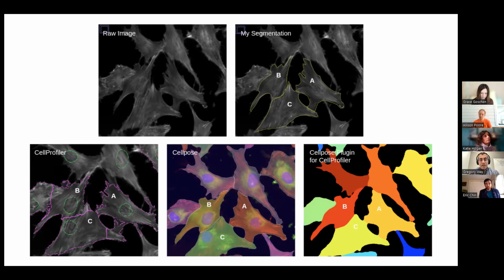It's a really important insight there, that you really have to rely on ground truth when you're doing evaluations. And for segmentation, almost never do you have ground truth unless you're running a simulation where you know exactly what the boundaries are because you've preset them.